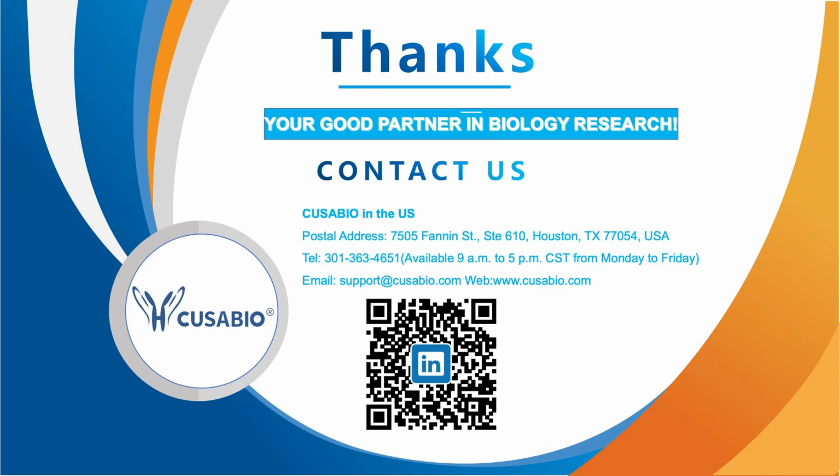So you can establish the DT3C concentration gradient, and in this step, you can keep the antibody concentration fixed. Once the optimal DT3C concentration is fixed, then you can use the same method to determine the optimal antibody concentration. So then finally, you have the optimal DT3C concentration and the optimal antibody concentration. Then you can perform the experiment to detect the antibody internalization efficiency based on different dilution ratios.